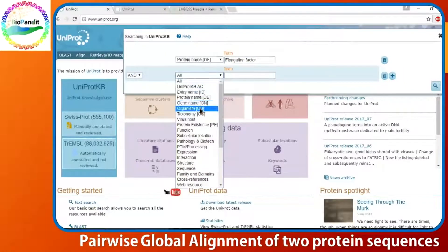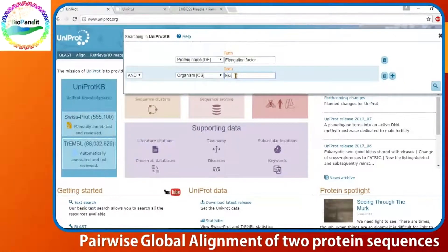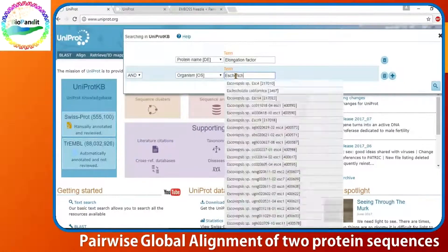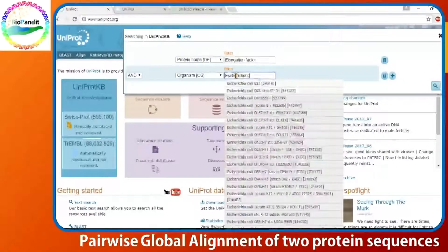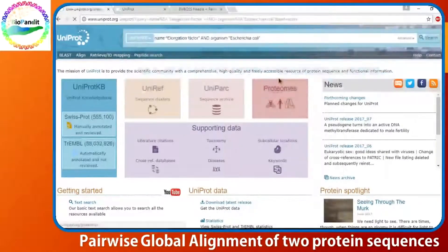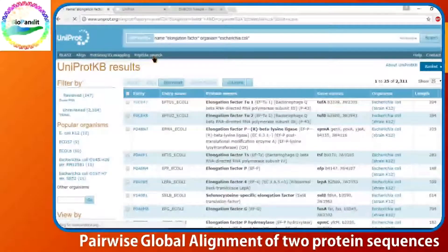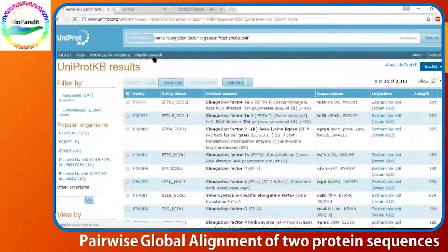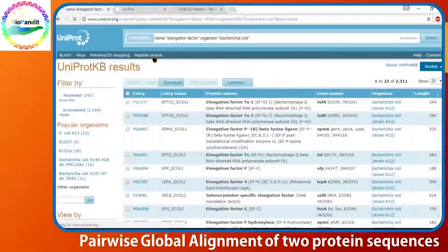Next, we select organism. The first organism is Escherichia coli. Now, hit the search button. It shows you documented elongation factor sequences for different E. coli strains.